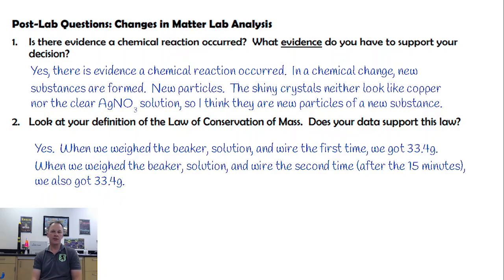Sometimes you might smell something new, right? Because that's a physical property of substances. And also those crystals. You know, we started out with copper and clear liquid, and we got those shiny white crystals. So that's also evidence that we've got something new.